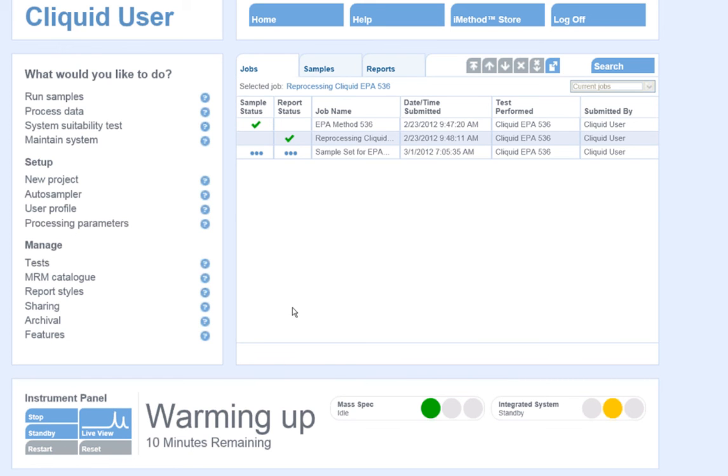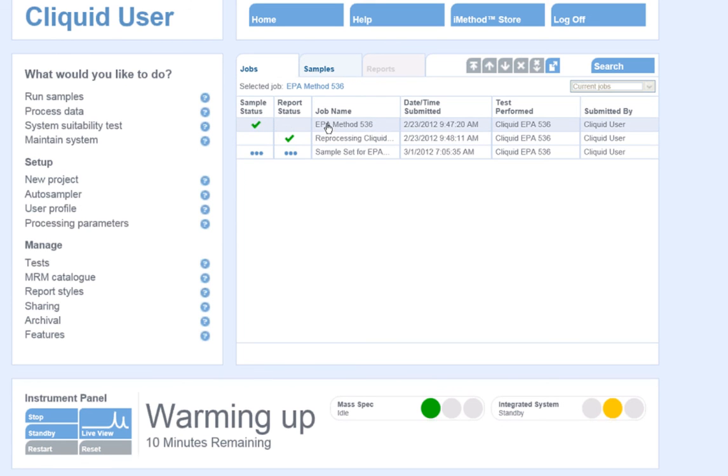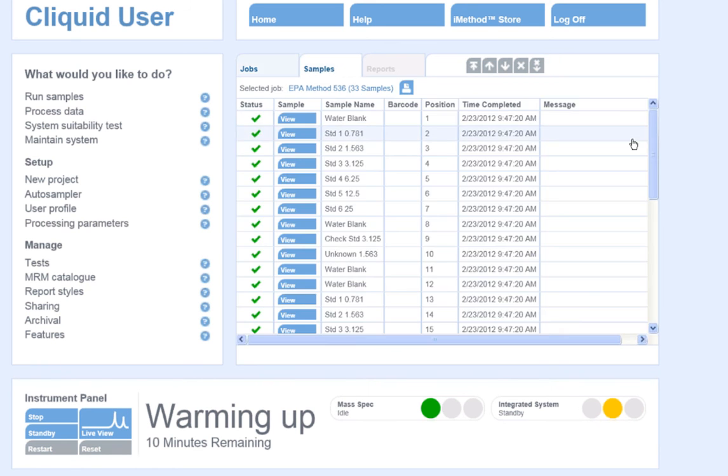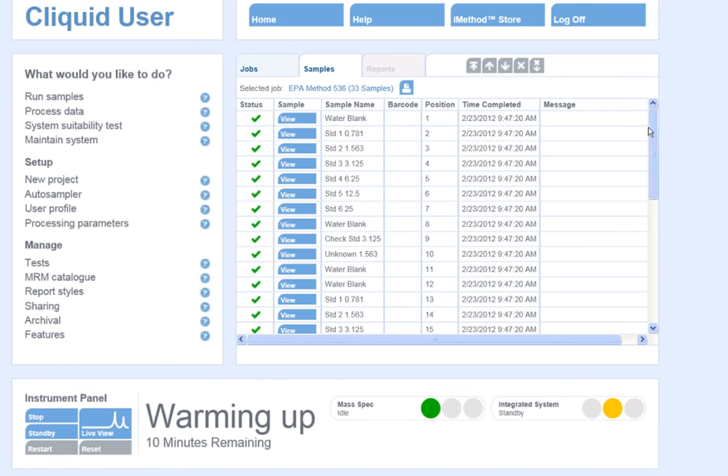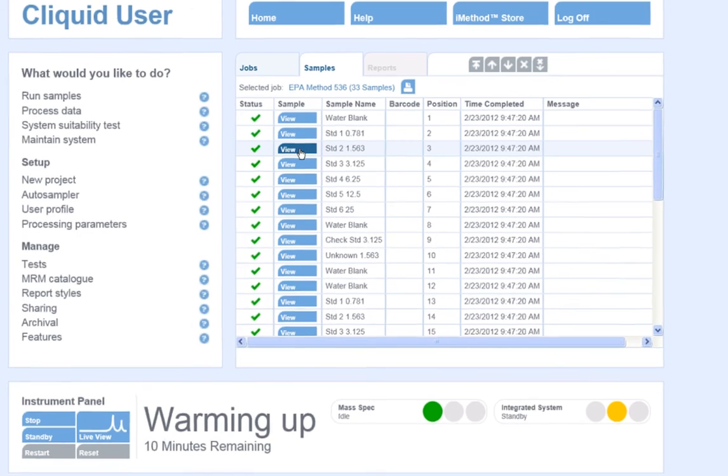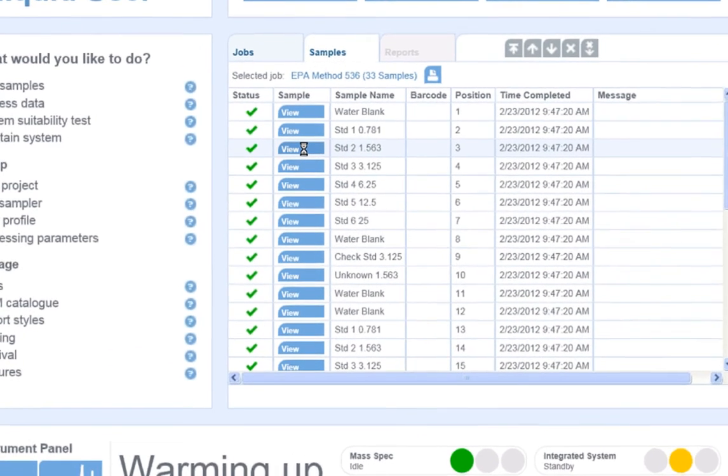If I look at data that has previously been acquired, and I highlight the job name on the home page, I can see all of the samples that comprise this job list by clicking on the Samples tab. I can click the View button to the left of each sample to look at the chromatogram that was acquired for this sample.